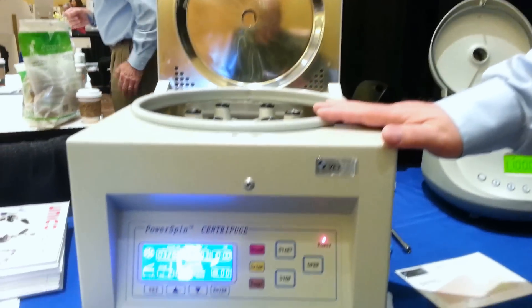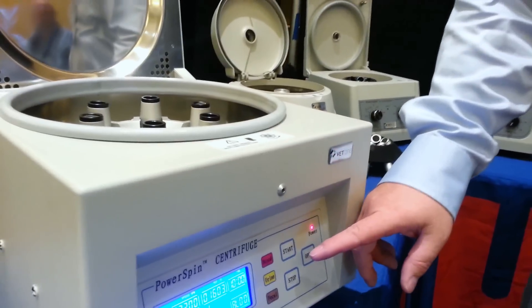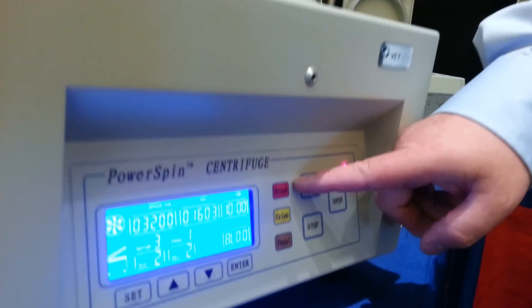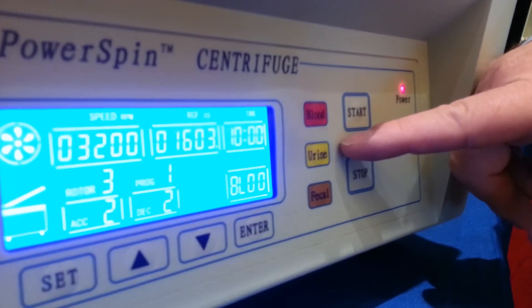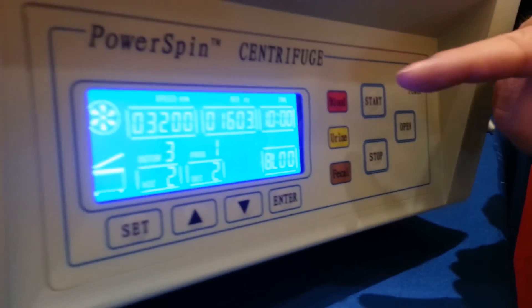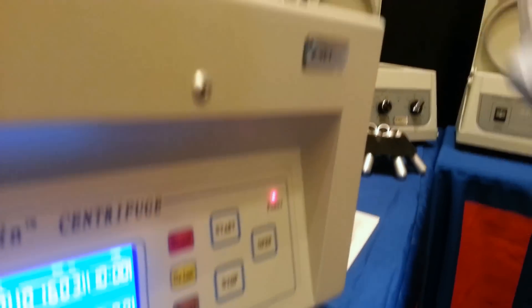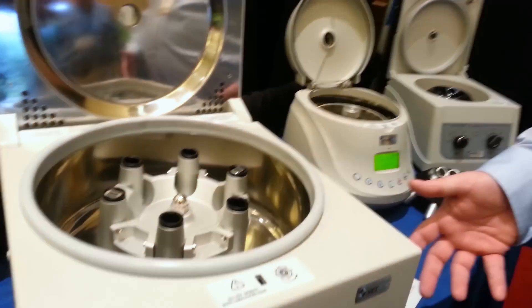This is our new large centrifuge with a completely redesigned instrument panel. It's color-coded — red for blood, yellow for urine, brown for fecal. All you have to do is push the specimen that you like, push start, and walk away. It will do the run for you, then shut itself off and open the lid when the run is completed. It couldn't be easier.